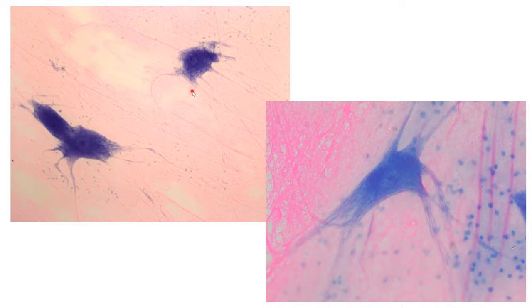By the way, the reason these cells look so blue is because they're filled with proteins. So the proteins that are all over on the inside of these neurons help the neuron to send messages. Eventually, you can see how there's little strings, these little stringy proteins that go down here. A neuron makes neurotransmitters, it makes its messages in the cell body, and then it's got to send them all the way down its long part called the axon.